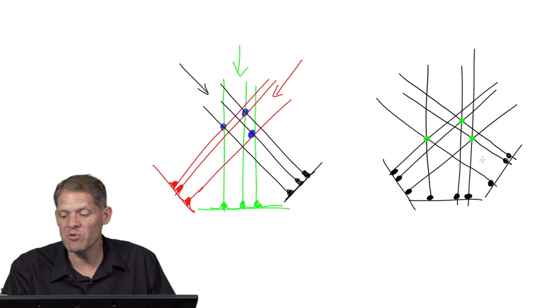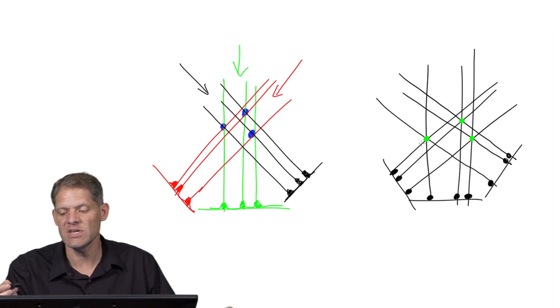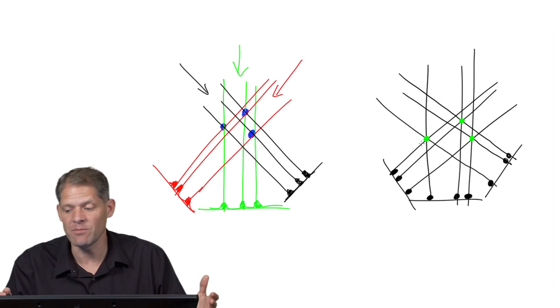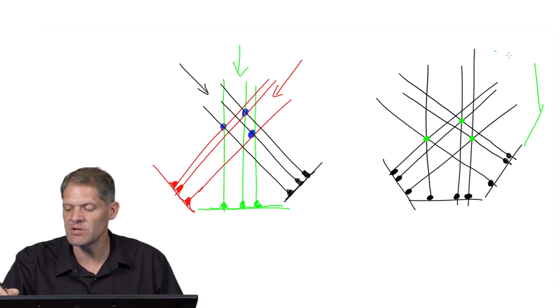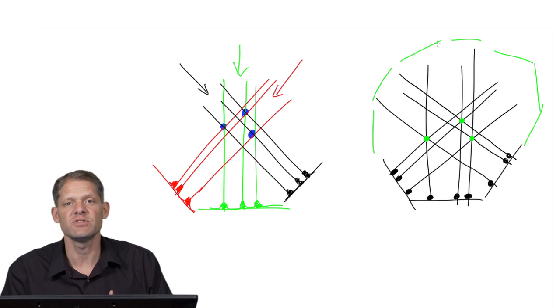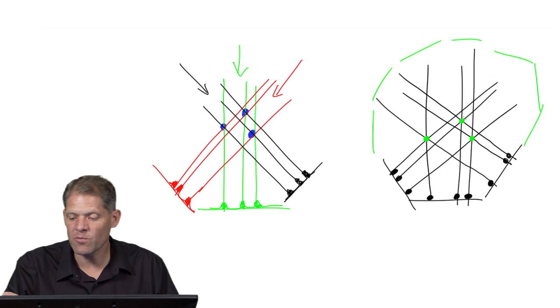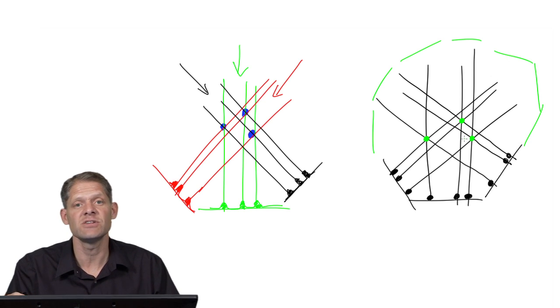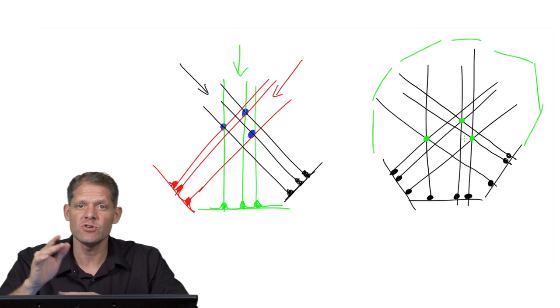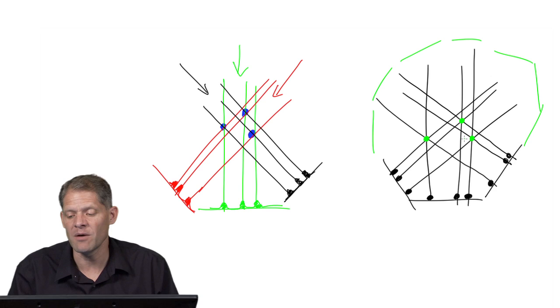So even with just three projections, these three positions now are the strongest, and you can see that's where the components were. But imagine if you had 100 projection images from all around this object, then you could imagine that this back projection procedure would be even more powerful, because the locations of the real components would now be the intersection of 100 lines, whereas all the other intersections would become 2, 3, 4 lines, and so the real positions would become clear.